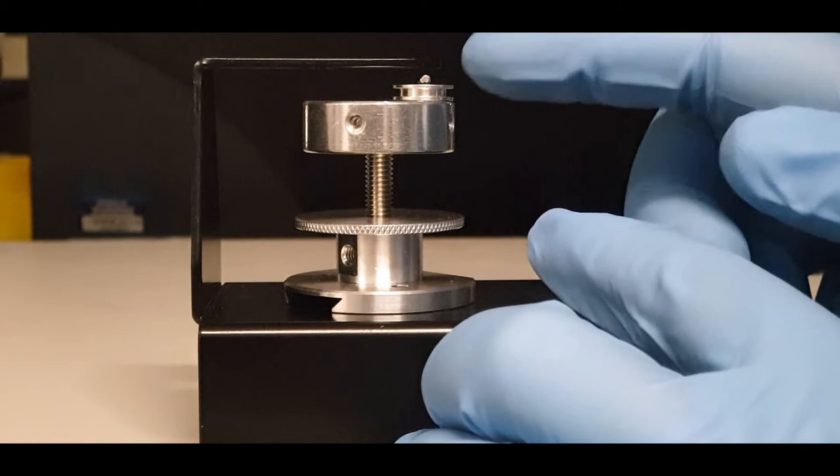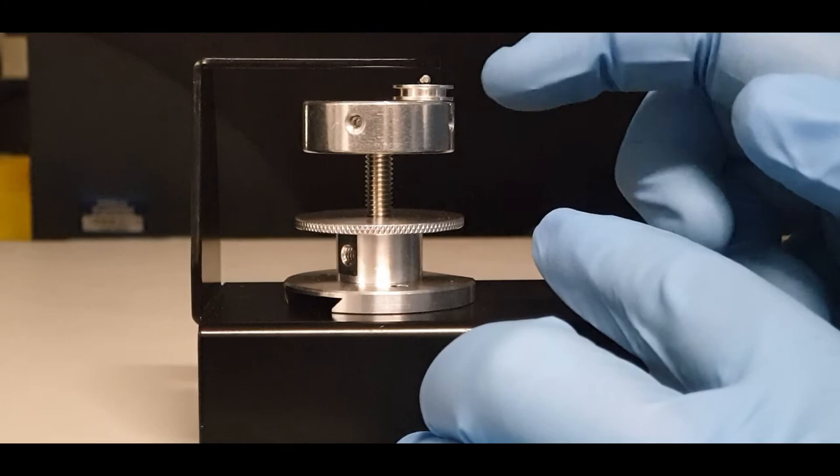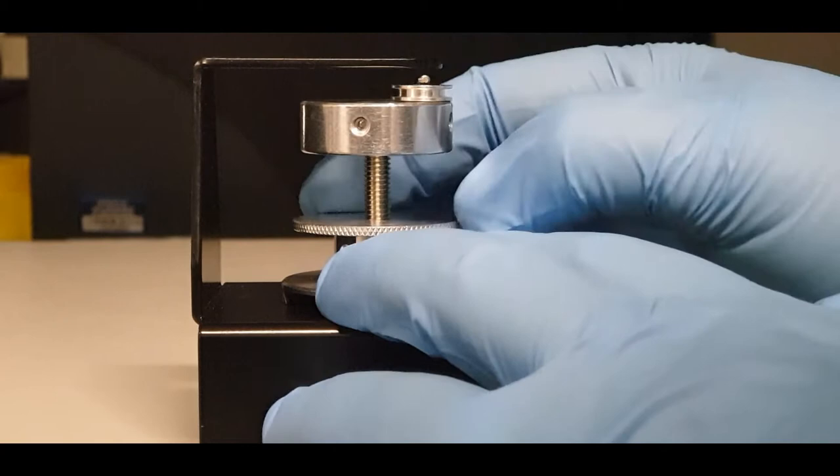If the sample is more than one millimetre away, that is okay. But if it is within or close to this surface, you are in danger of contacting the instrument. So keep this surface one millimetre or more away from the sample. Once you've set the height, hold it in place and lock the locking ring.